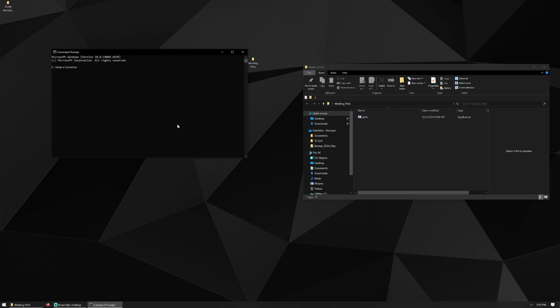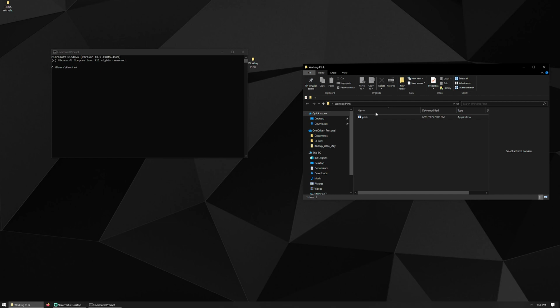So this is the terminal from which you will be interacting with Plink. Anytime you're working with Plink, it's going to look a little bit like this. But we need to actually get to Plink. You can see it started me out in a directory. So I am at C users Kendra. You can almost imagine this is a folder that has opened. We need to navigate that to have this particular folder, the working Plink folder, open instead.